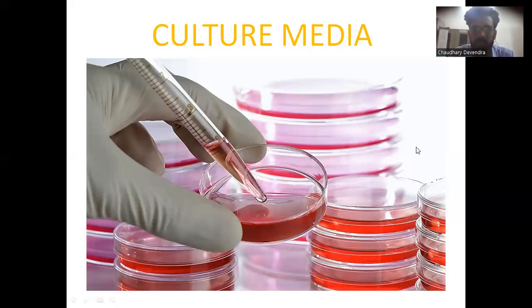Culture media can be liquid, solid, or semi-solid, and there are anaerobic bacteria media, aerobic bacteria media, special media, enrichment, and indicator media. So many culture media are there, and we will discuss them today.